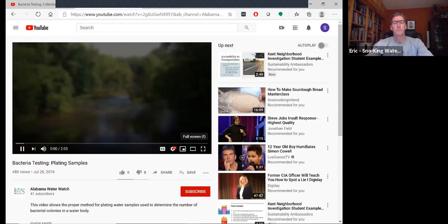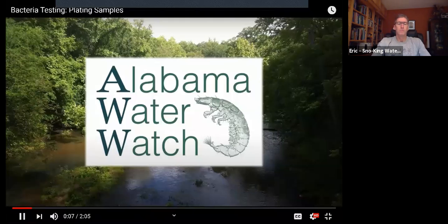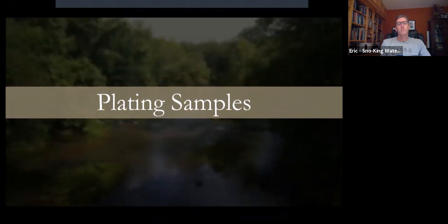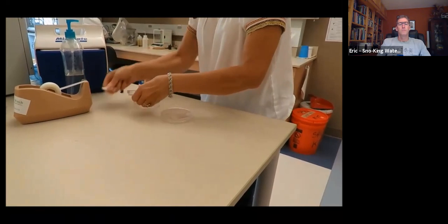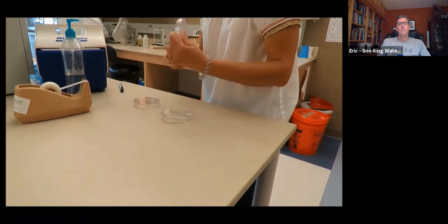Welcome to the Alabama Water Watch instructional video series. This video will show the proper method for plating water samples used to determine the number of bacterial colonies in a water body. This is the second step in a three-step process. The first and third steps, collecting the samples and determining results, are covered in their own separate videos. Prepare your Petri dishes by taping the top, the larger piece, to the bottom, the smaller piece, on one side of the dish. Keep the dish closed as much as possible to avoid contamination.